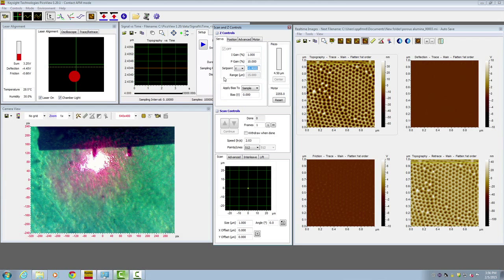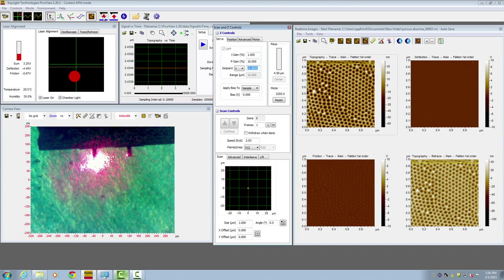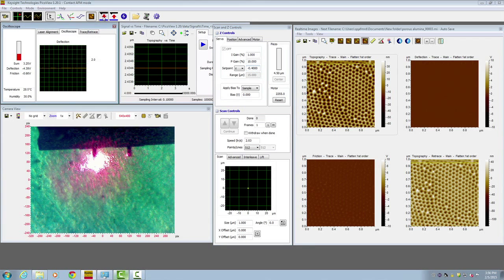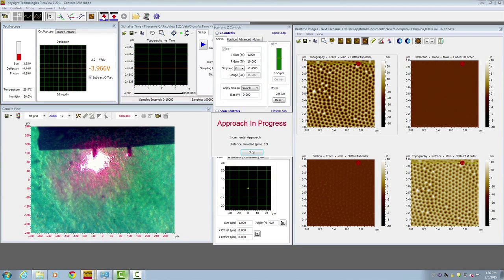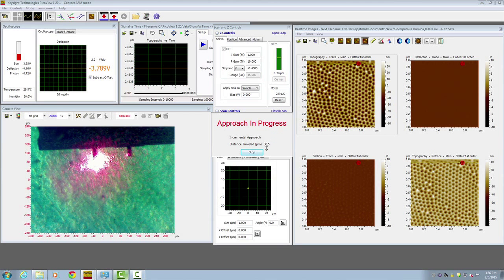Now we are ready to approach. Here is the approach symbol. Click on it. The sample will move towards the tip. The approach in progress window shows up and also shows how much distance the sample has traveled.